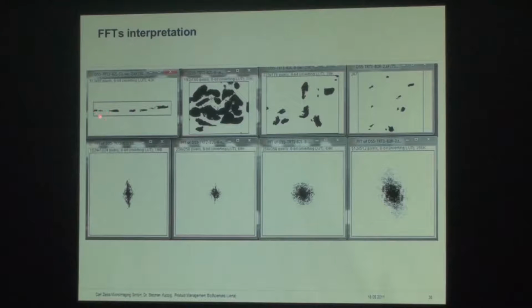So if you look at this nuclei, you can see a horizontal shape and kind of an elliptical shaped nuclei, and it has a pattern and a specific orientation. You can see that with the distribution of these frequencies, an elliptical shape which determines the elliptical shape of the nuclei. It also tells that the frequencies are much lower because it is very close to the center.